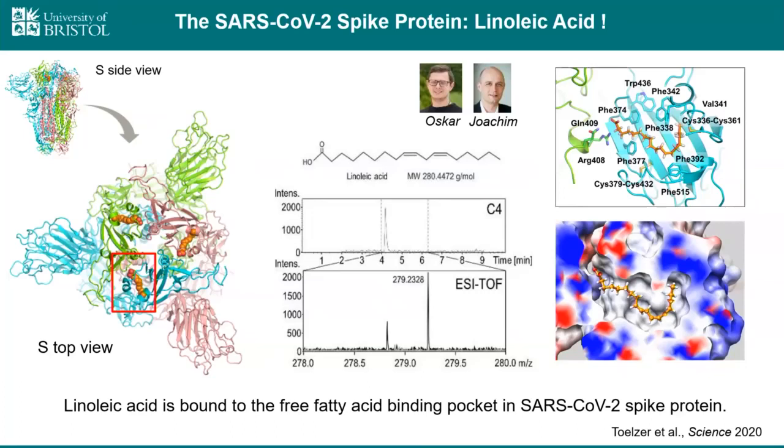So he had GFP expression in SARS-CoV-2 virus, and this has been treated with remdesivir, which at that time was the only drug known against COVID. And you can see that you need quite a lot of remdesivir to actually stop viral replication. If we add on top of this 50 micromolar linoleic acid, then you have many fewer green virus infected cells here. So altogether, the viral replication is inhibited.